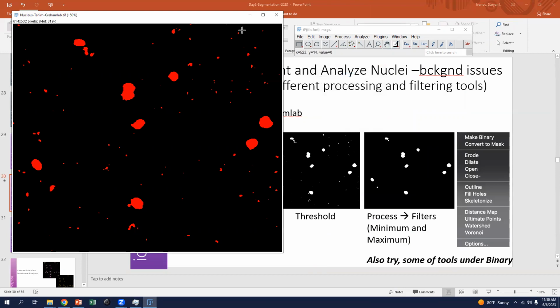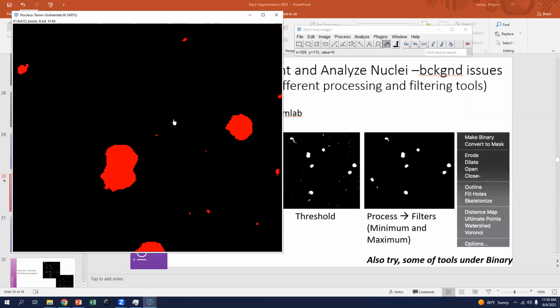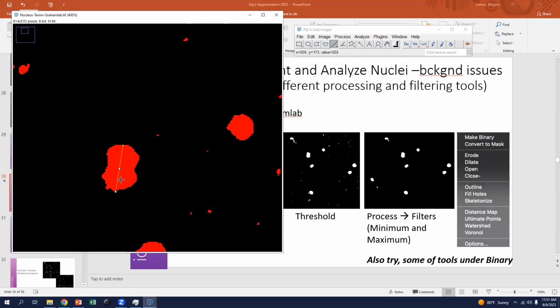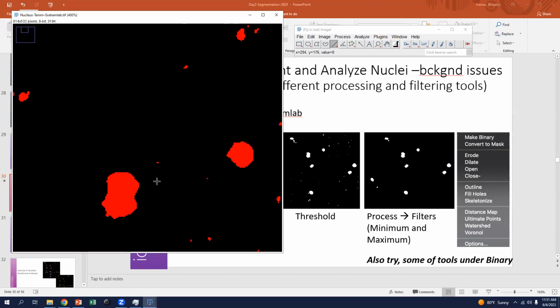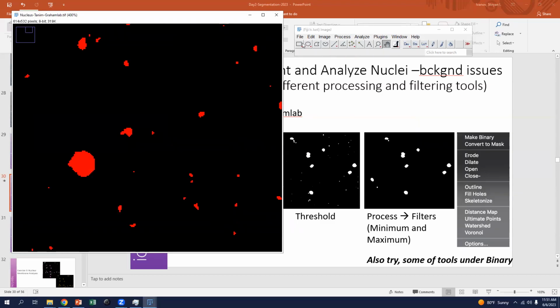So let's do a little bit of measurement, seeing what the size of our structure is. So let's go a long way. Up here we can see a length of 41 pixels. And this length is in pixels because this image doesn't have a scale. So we want to catch structures which are 41 pixels across, 32 pixels across, okay. But what are the really small ones? What's their area?